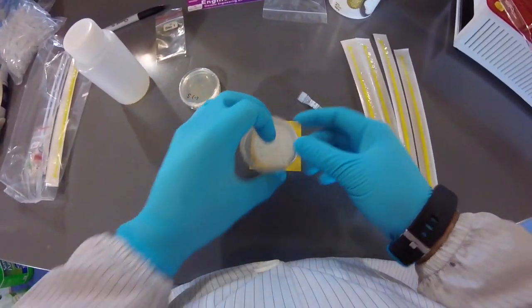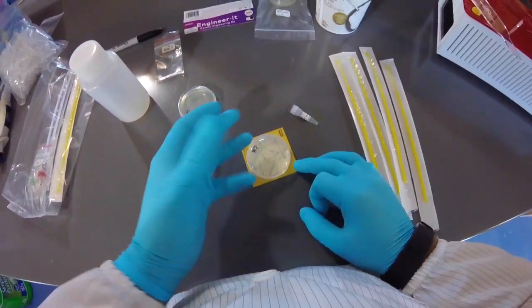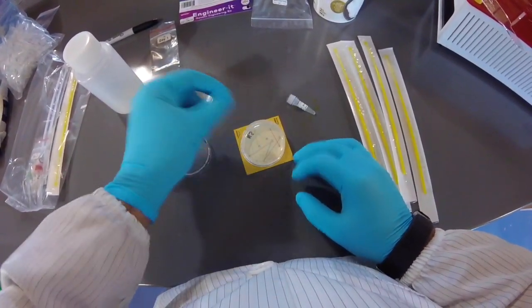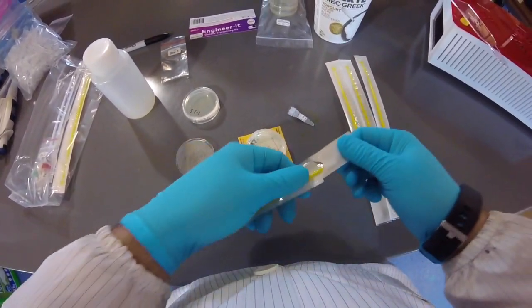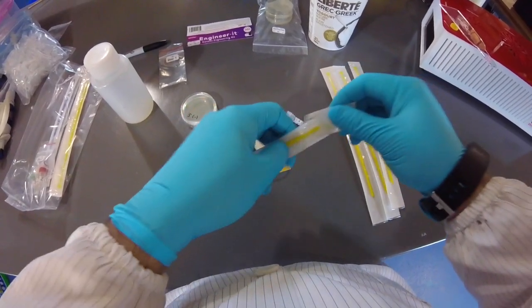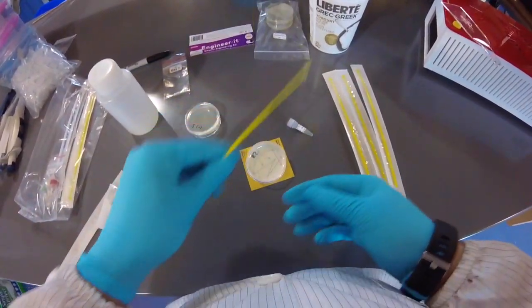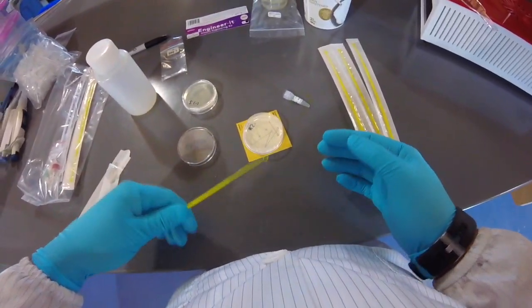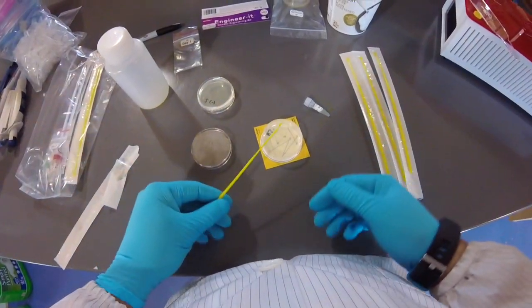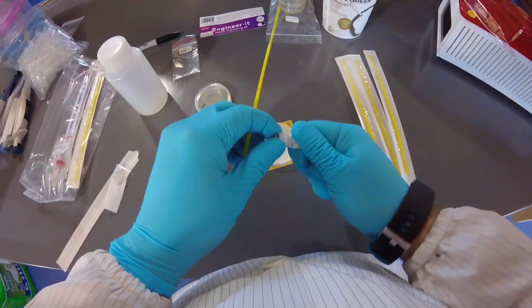So let's go ahead. You can put your non-selective plate on top here. Because I'm left-handed, I usually put the line I need to draw on the right-hand side. And you can open up these by simply pushing so that the back part pops out, and then you can pull it out. This is a loop, it's sterile. You don't want to touch this end, you don't want to touch it to the table, you don't want to touch it to your hands or your body. Okay, so keep that sterile.